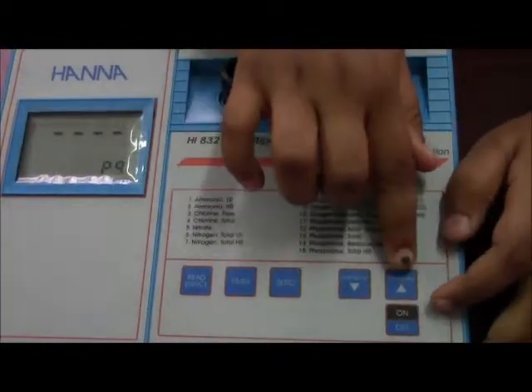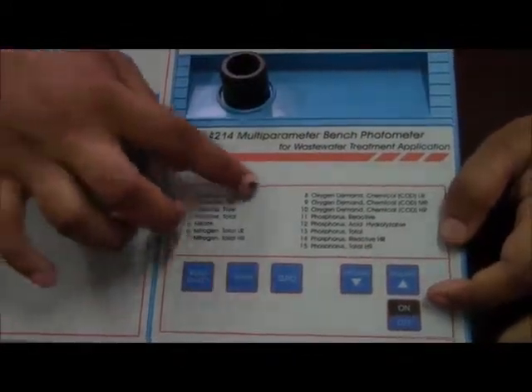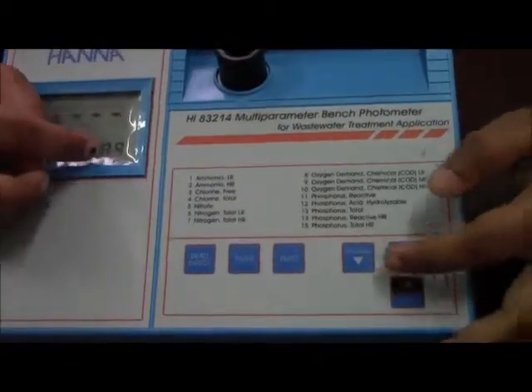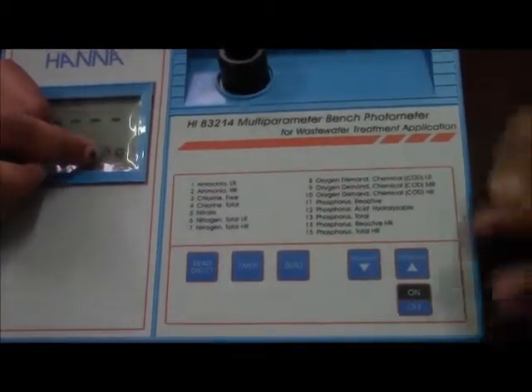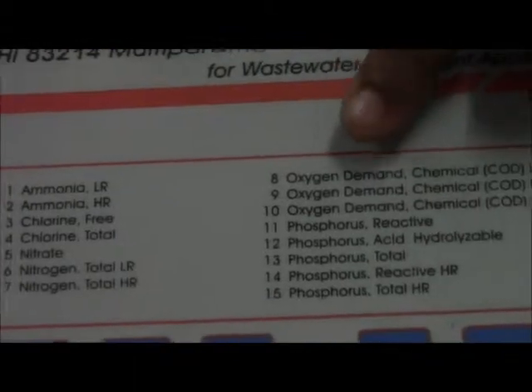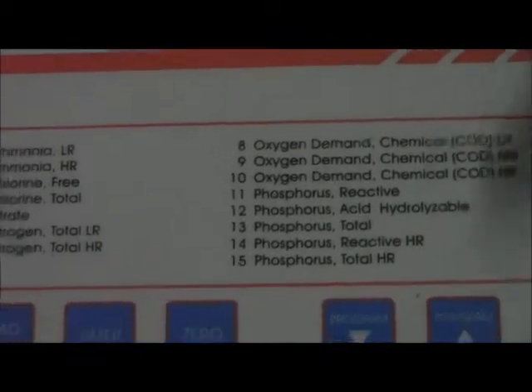With the help of the navigation keys, we can select which parameter is to be analyzed. Now it is P9, that is parameter number 9, that is chemical oxygen demand middle range.